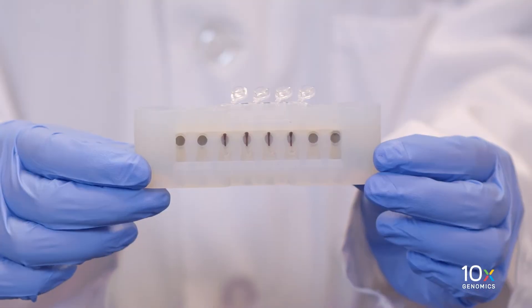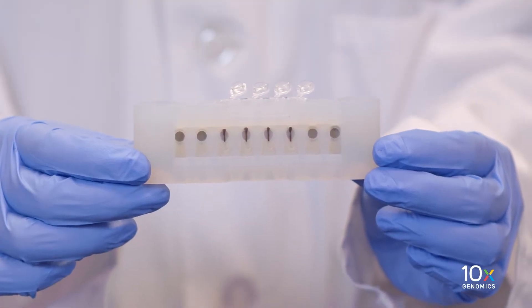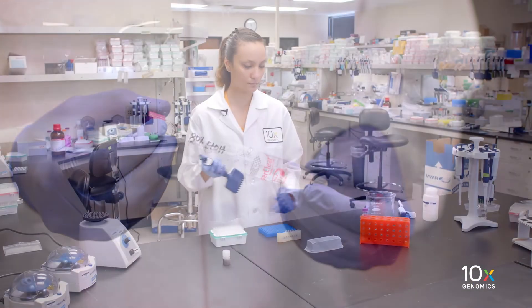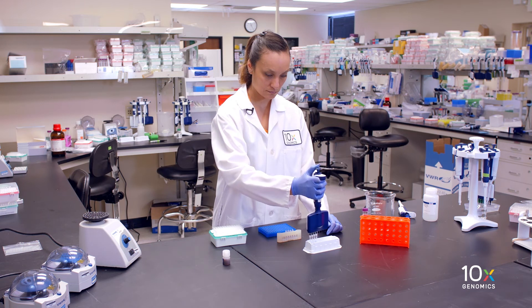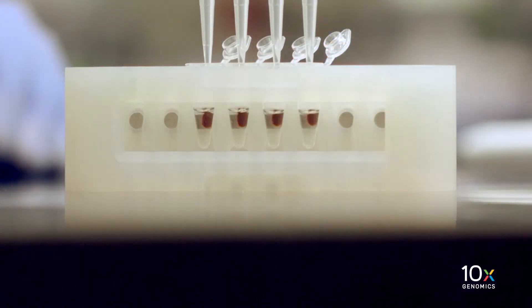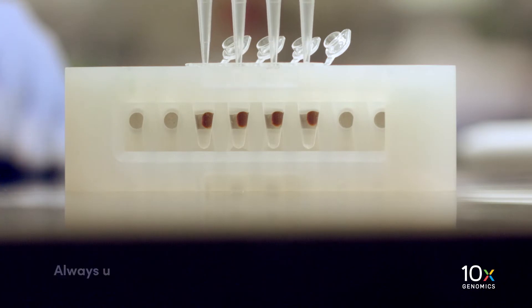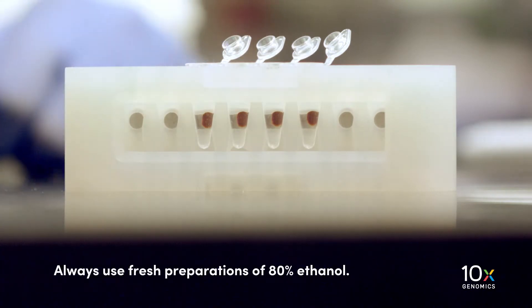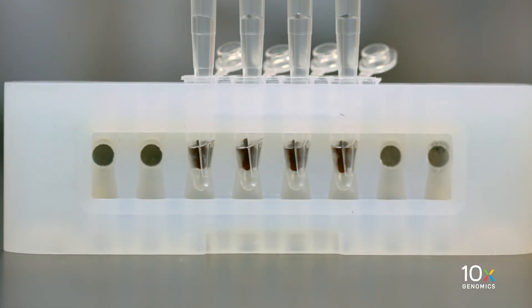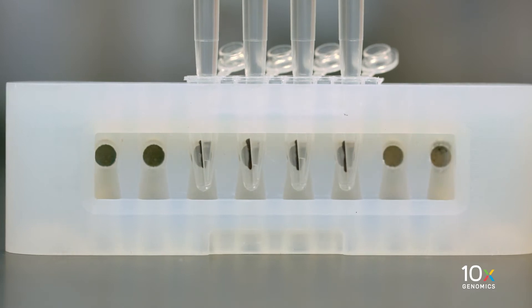Next, we'll immediately proceed with the SprySelect cleanup of the pellet. We have our pellets in a tube strip and freshly prepared 80% ethanol. Add 200 microliters of freshly prepared 80% ethanol to the pellet and let stand for 30 seconds. Always use fresh preparations of 80% ethanol. Carefully remove and discard the ethanol wash. We perform this 80% ethanol wash twice.